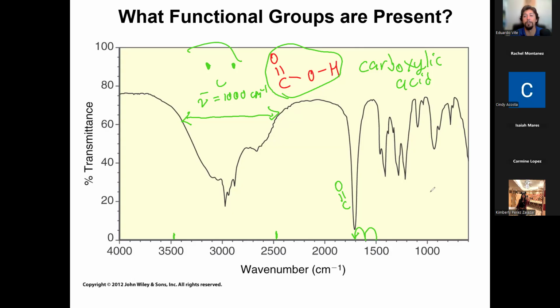And that's it. I don't know if this is benzene or C7H, whatever. All I know is there's a carboxylic acid here. And that's all we can learn, right? So again, I just want to emphasize that this is a partial method to the complete analysis. This is not like a standalone thing.